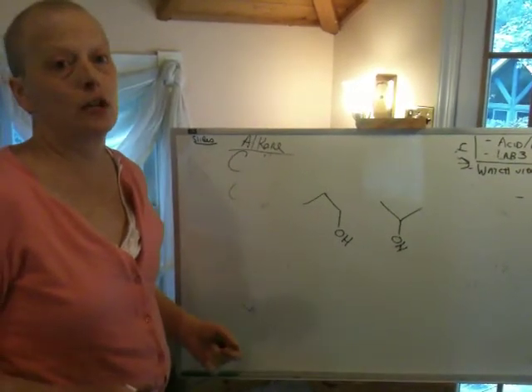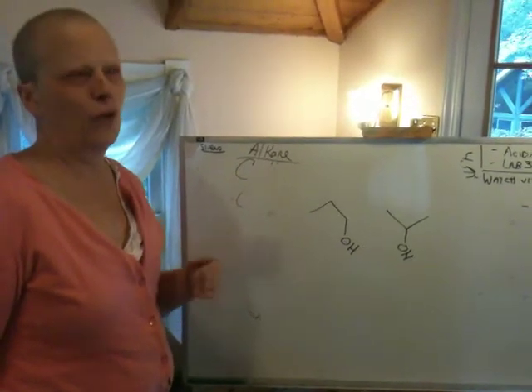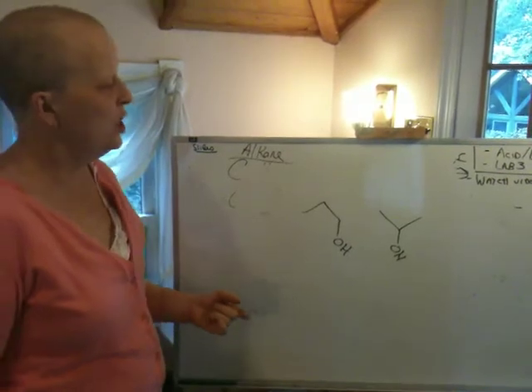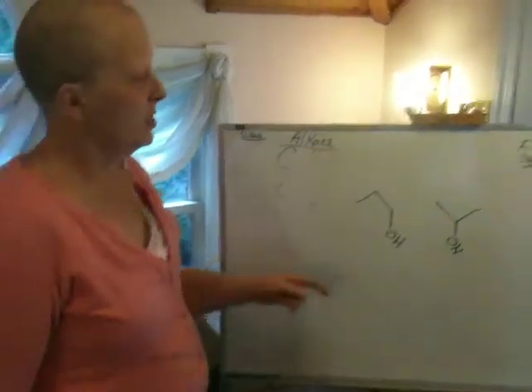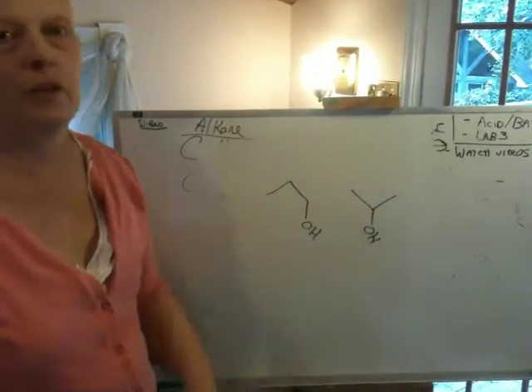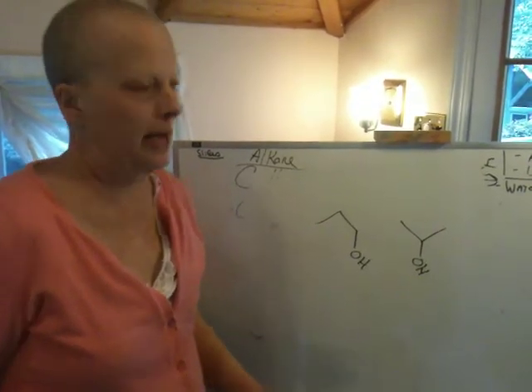That spectrum is actually of isopropanol, but realize there are millions and millions of organic compounds that are known, and the idea that in a 1-second or 4-second scan, which is about how long it takes to run an infrared spectrum, you could narrow it down to 2 compounds, that's pretty big news, right? So when you get down this far, you could interpret a little more in the fingerprint region, or you could run an NMR spectrum and you would know what you had.